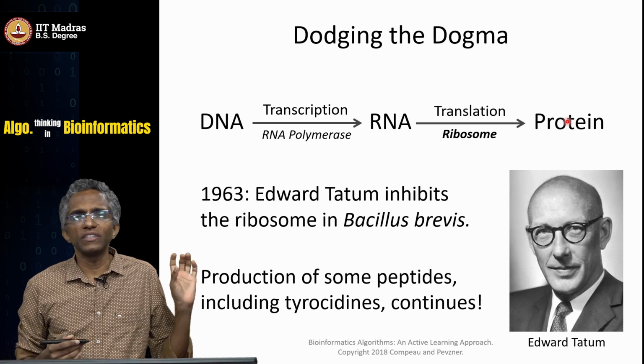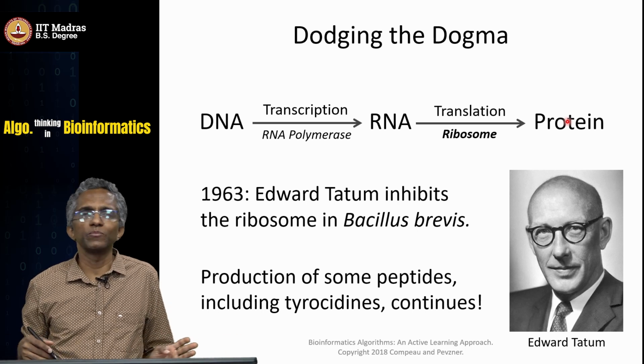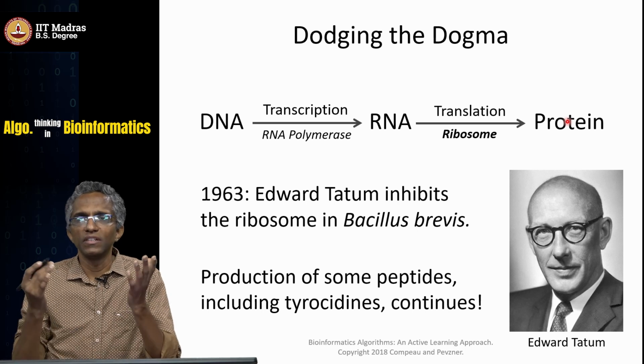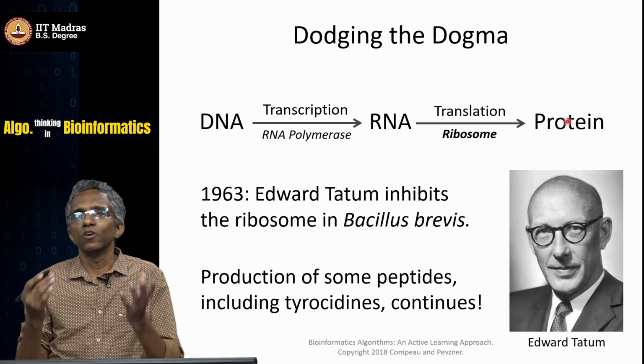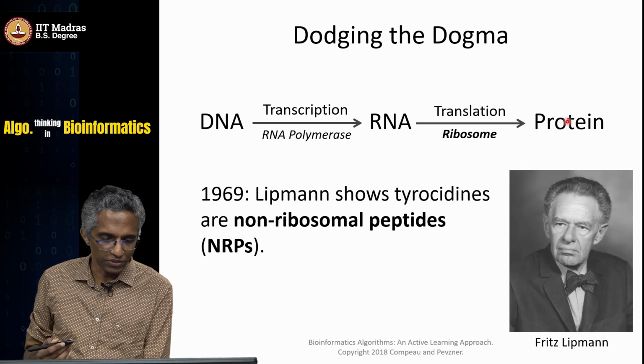So we cannot just look at the DNA sequence alone, the RNA intermediary and the genetic code to get ideas about what the sequence of a protein could be. We need to work directly with proteins as the prime player, look at their composition, and get the sequence directly from working with the protein molecules.